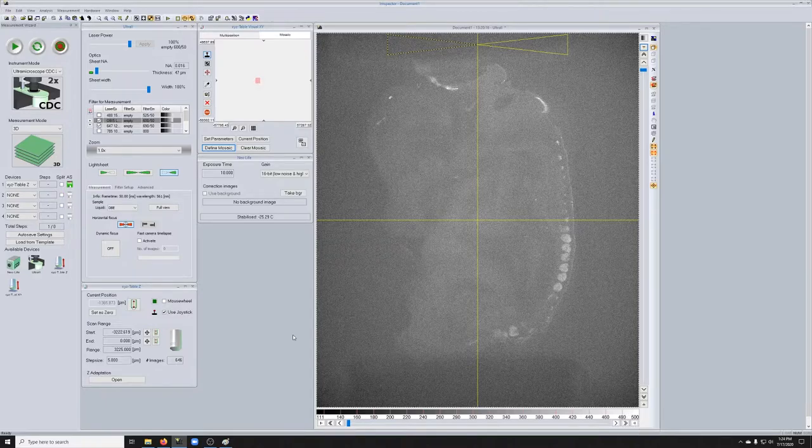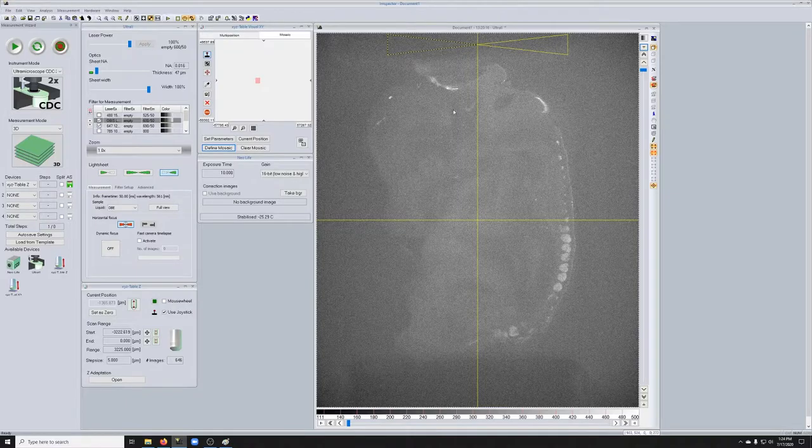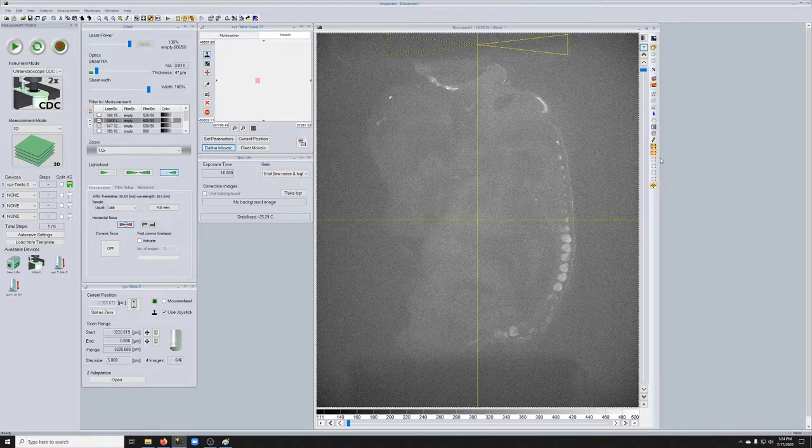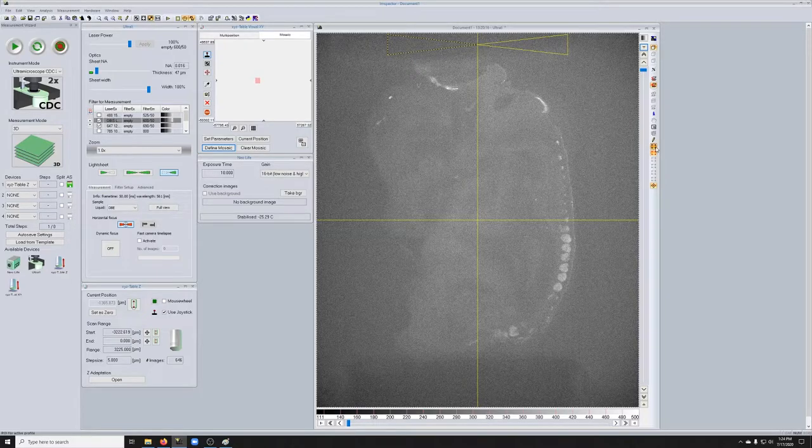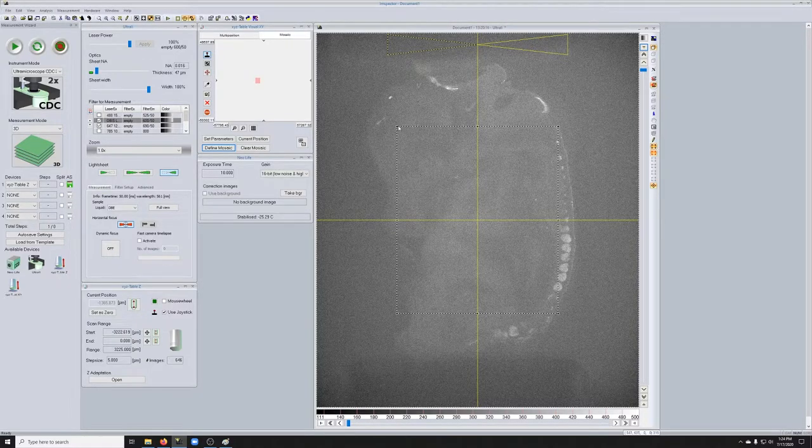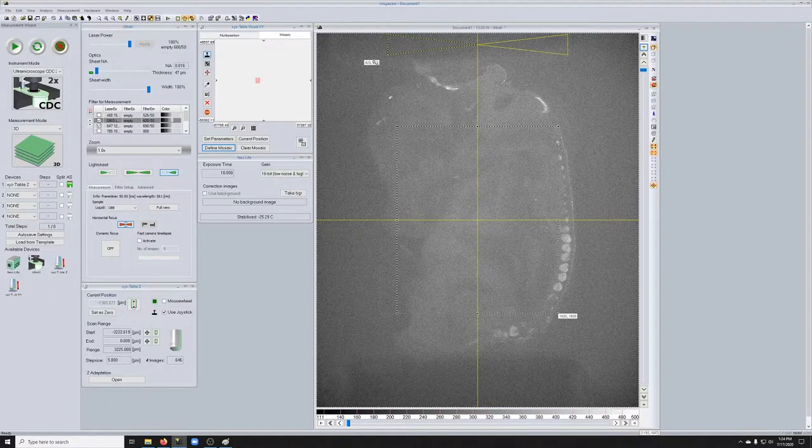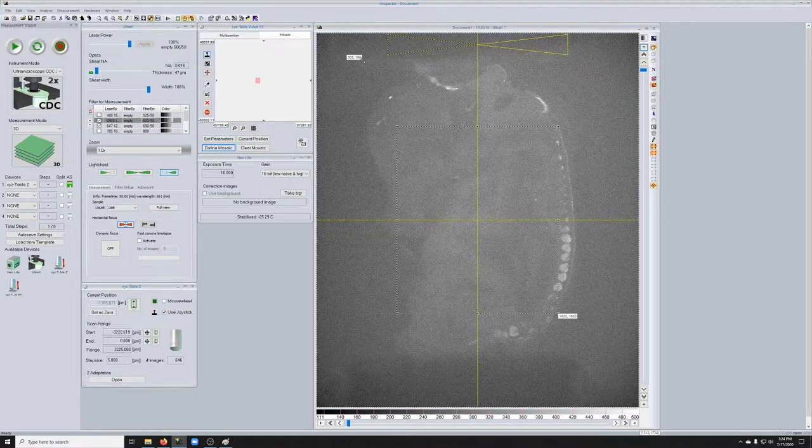So how do we crop? The way we crop is first we need to see a region of interest, then adjust it to the desired size, and then hit the cropping button. To see a region of interest in the image we click here. If you don't see anything just click again. We'll resize this so that it is at the proper dimensions.